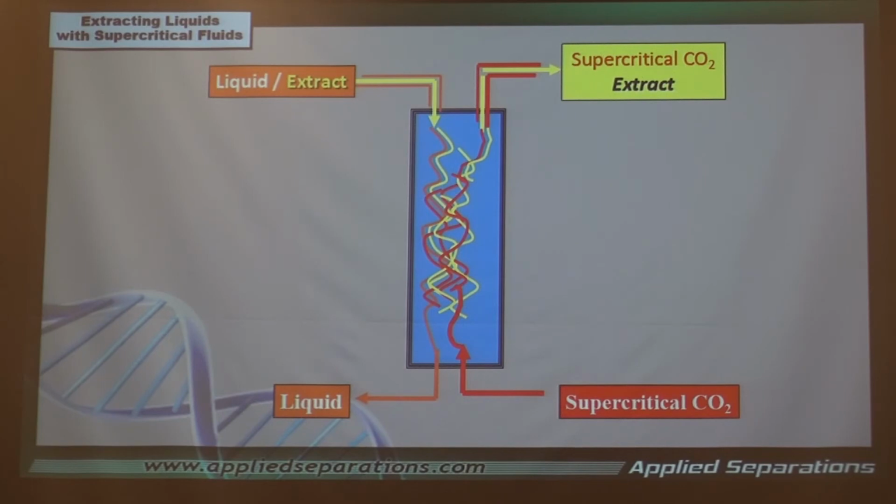Now, keep in mind again, one of the very important parts, and I'll drive this home over and over again, is the fact that by changing the density of the CO2, we change its solvating power. I'm going to pass through all of the calculations, because it's getting late, and I want to move on and just show you conceptually what we're doing here.